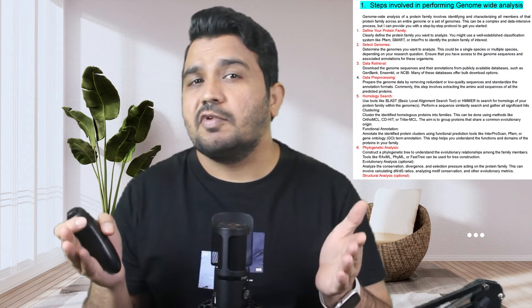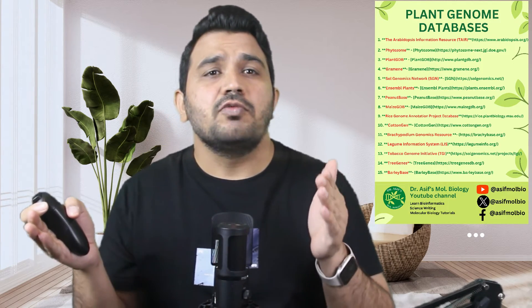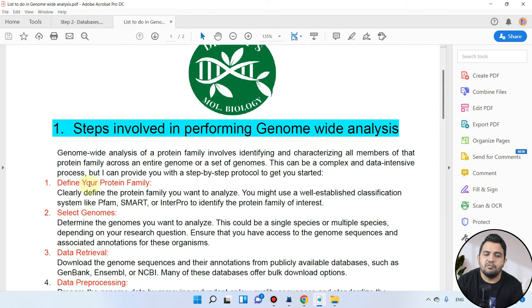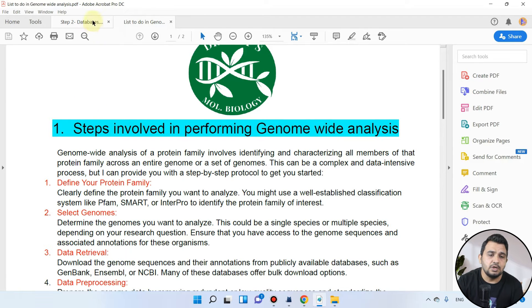As in step 1, we discussed how we can define our selected protein. Now we will be looking into different plant genome databases which we will be using for protein sequence extraction. In this to-do list for genome-wide analysis, the first step was to define your protein family, which we covered in a previous video. Now we will be selecting genomes, especially the plant databases.